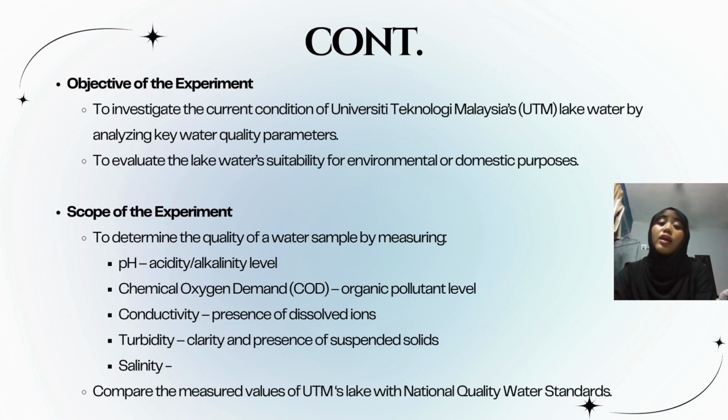Now, let's take a look at the objective of this experiment. The main goal is to investigate the current condition of University Technology Malaysia UTM lake water by analyzing several key water quality parameters. From there, we aim to evaluate whether the lake water is suitable for environmental or domestic purposes based on established standards.